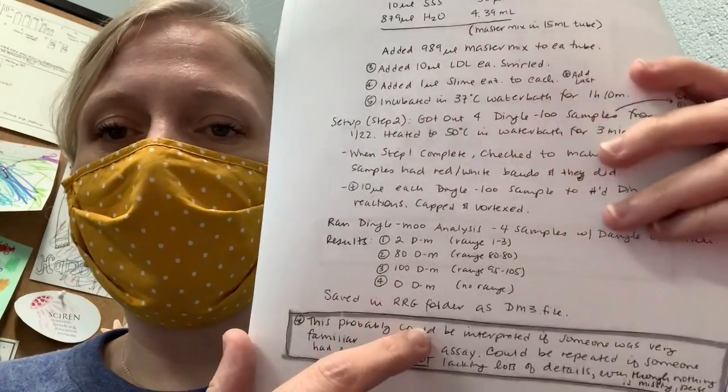So this one's one that's a little bit less detailed. Again, like I said, if you've done something 10 or 15 times, you may be able to take some shortcuts. And if it's really close to a protocol we have, you might be able to back up to something like that. Again, please don't do this in the beginning, because you're not going to have enough information for yourself.